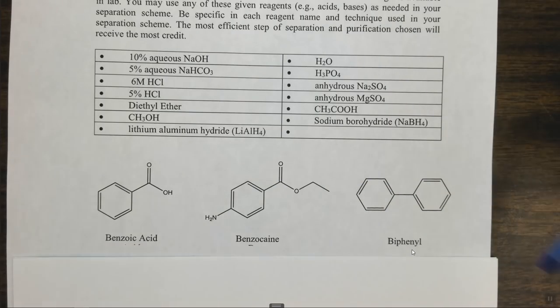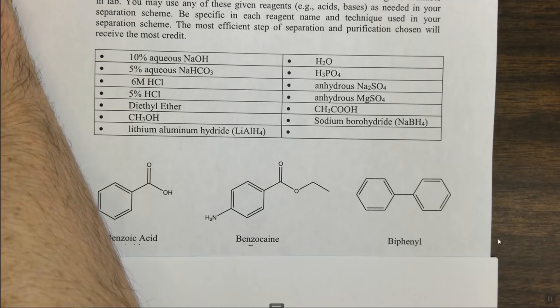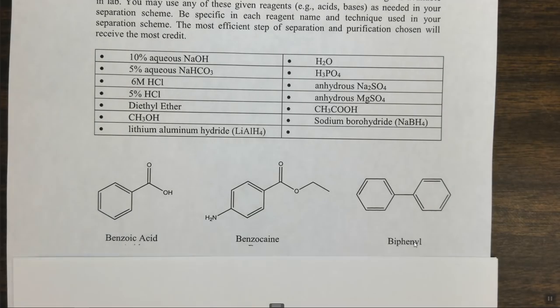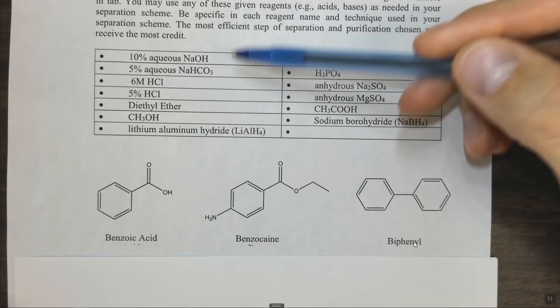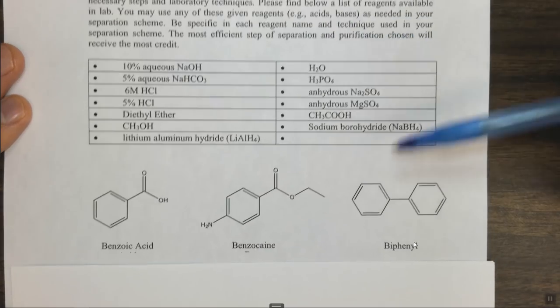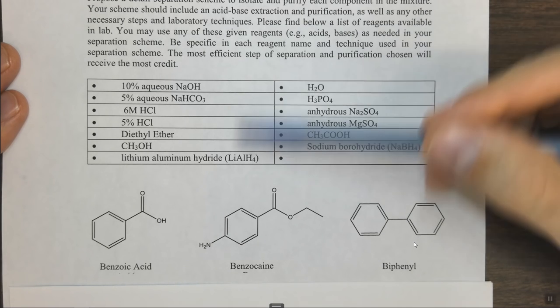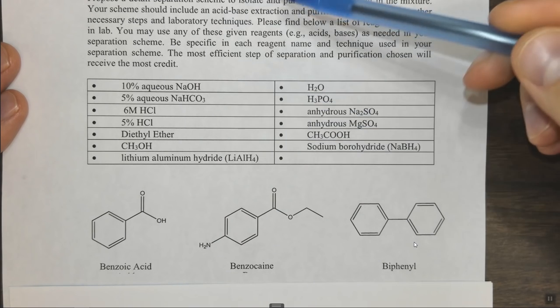If you look back at that experiment, you can find that those things have been made available as a previous video, but I do want to go through it quickly here. So here we have a list of the reagents available, and then we have regular techniques like extraction. We can evaporate and things like this. So the first thing I want to do is go through this list and knock off things that we may not use.